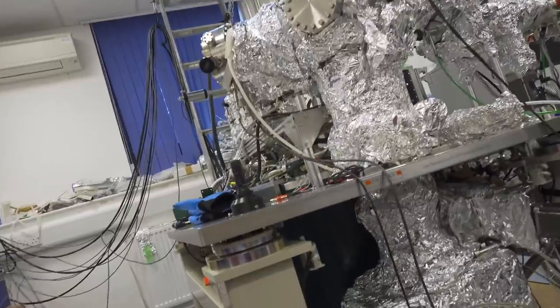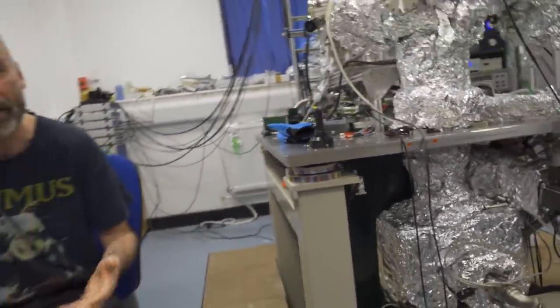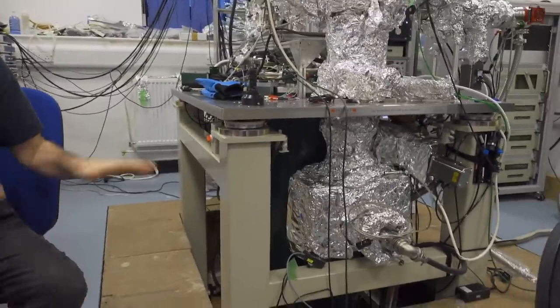You can see here, these air legs are in place to decouple the instrument from the surrounding building. Because we're trying to work at a level of fractions of an atomic diameter, and the floor on which you're standing, Sean, and which I'm sort of sitting, is vibrating up and down at the level of microns, so about a million times bigger in amplitude than the precision we want to get to. So we need to decouple the system from the external building, and one key way of doing that is with these pneumatic legs, which lift the entire system up so it's supported by those legs.